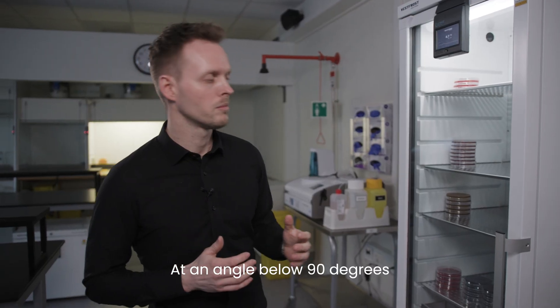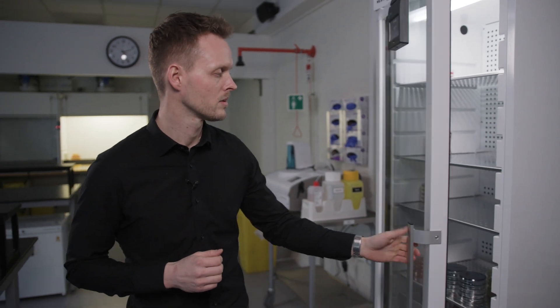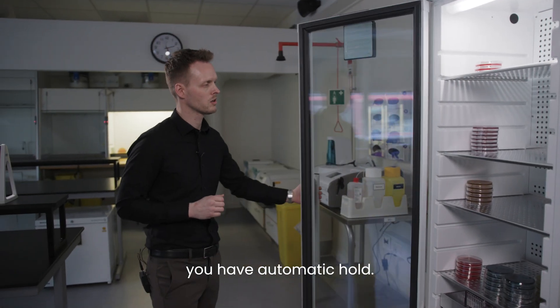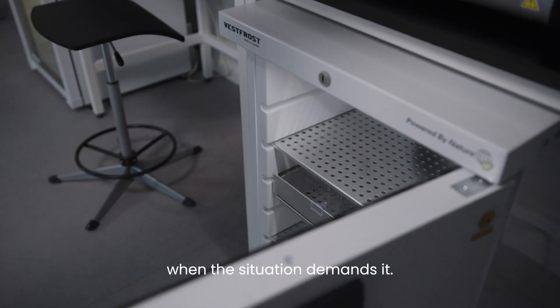At an angle below 90 degrees, the door has automatic closure, ensuring that the door is never left ajar. Once you go above 90 degrees, you have automatic hold, freeing up both your hands when the situation demands it.